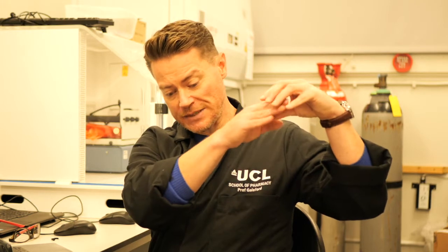If your sample is very thick, or it's solid, or it's coloured, so it won't allow light to pass through it, you can't use the light source underneath because the sample itself will block the light. And so you have a light source above the sample, which is called an incident light source, and that light will come down and reflect off the sample to the condensing lens, and then you can view it through the eyepiece.